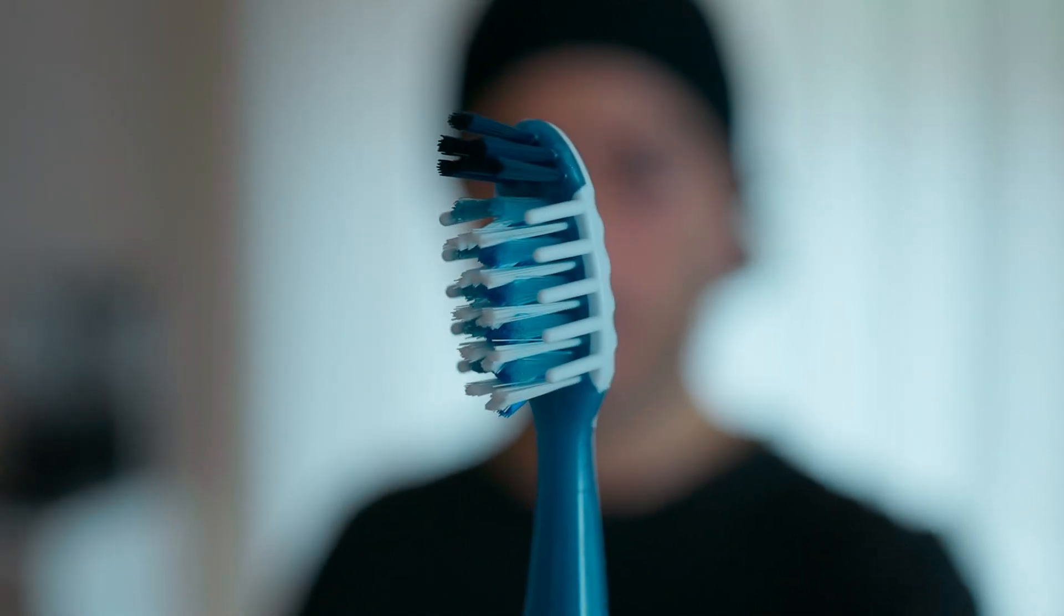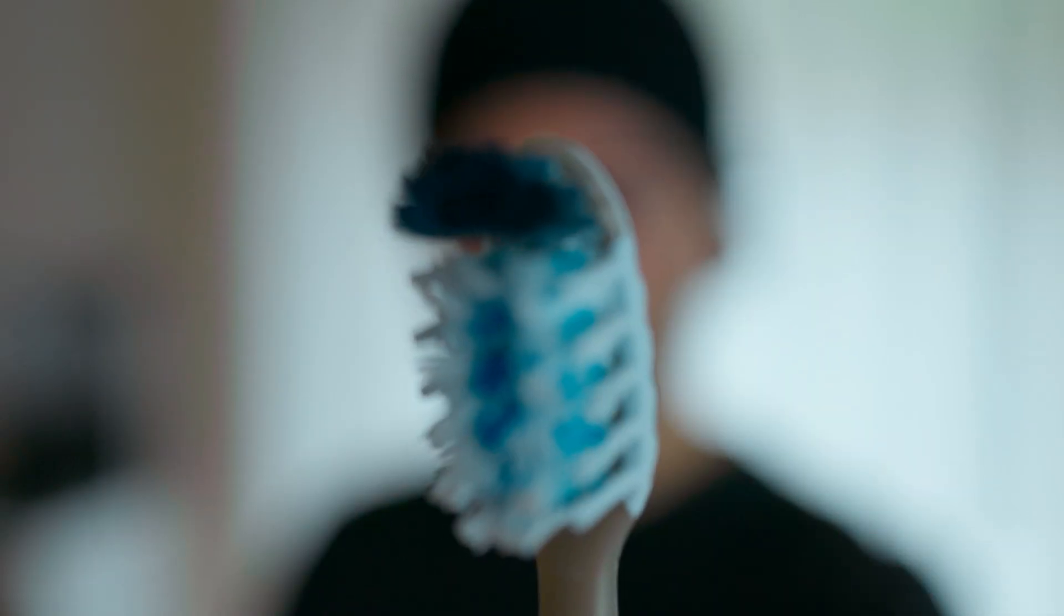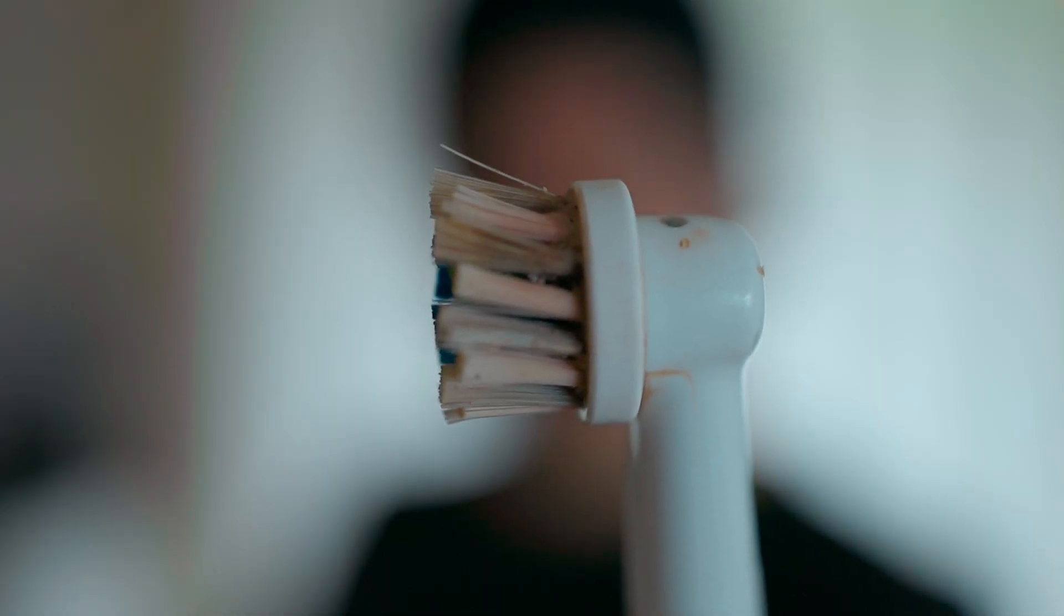Hello, this is Microscopy Enthusiast. Today I was planning to compare a brand new toothbrush to a three months old one, but someone gave me this electric toothbrush head that has been used for nine months.